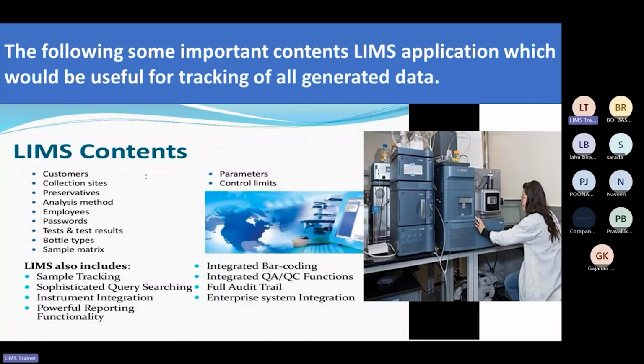Okay, so LIMS content. These are the different contents that are related to the software. Who are dealing with the particular software? See, the customers, collection sites, the preservatives, analysis method. These I am going to explain in our further lectures. Who are involved in or related to the software? Who is going to work with the software? Who is going to benefit from the software? All these things will be explained.